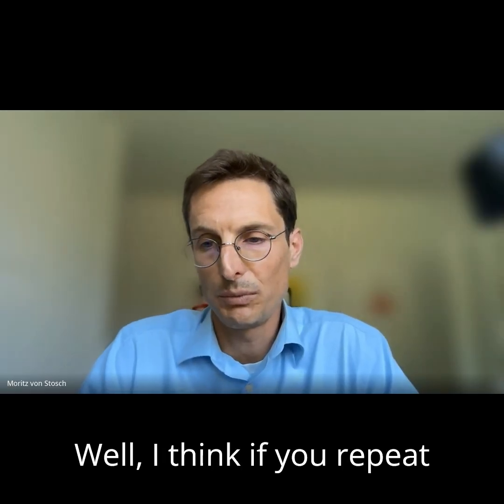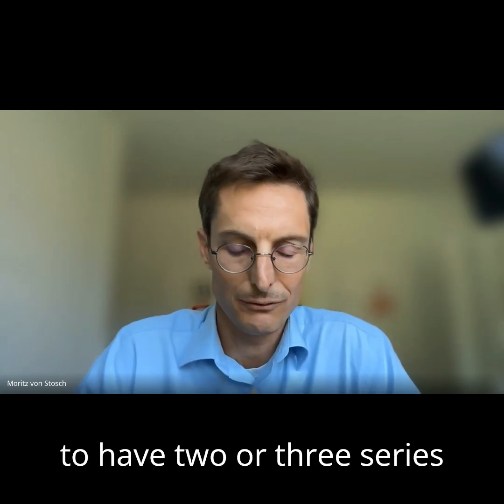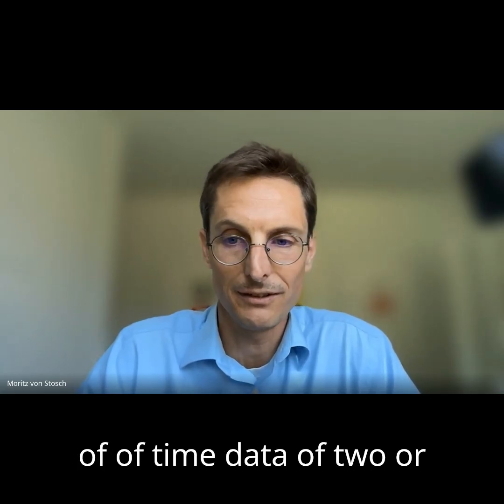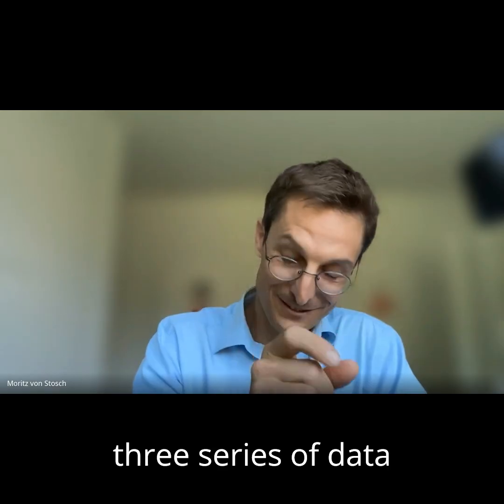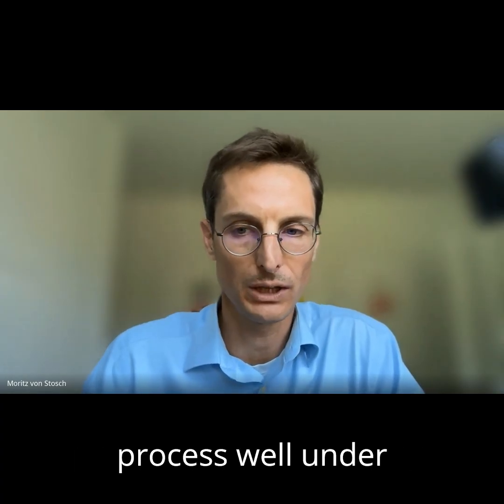Well, I think if you repeat the same process over and over again, it might be nice to have 2 or 3 series of data over time, but you don't need to do it all the time, in particular if you have the process well under control.